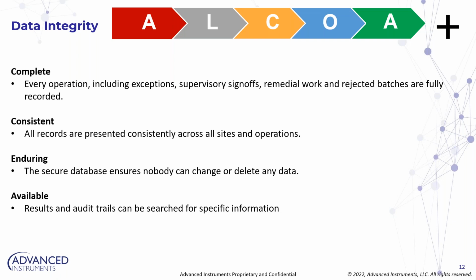And the last piece is available. Now, available has many meanings here in the sense that the results of the device are easily available. The events or the audit trail can be easily looked at, searched and reviewed on an annual basis, if that's your frequency, or biannually. Perfectly fine, that makes sense.